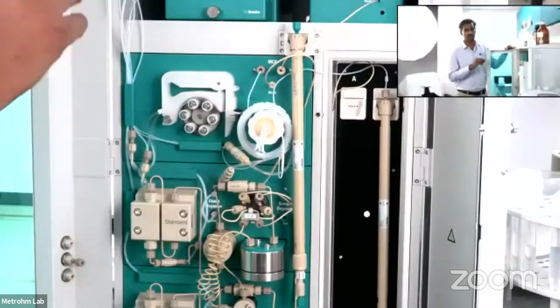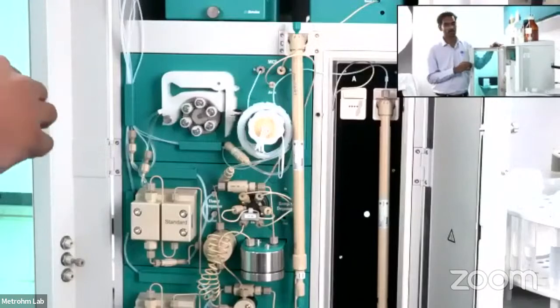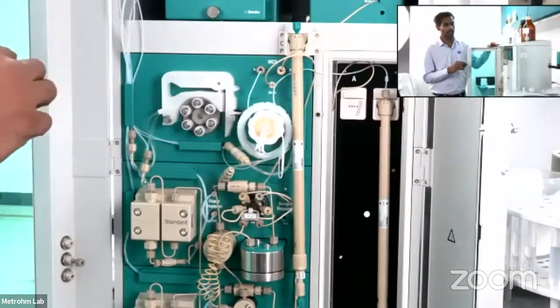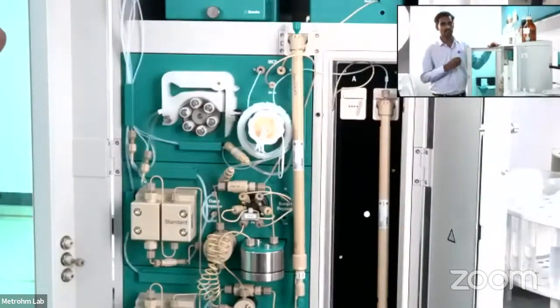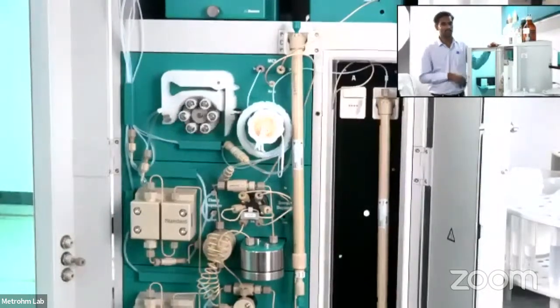Okay, so how many injections were done and how many hours this column has been operated, this kind of information will be stored in the chip. And whenever we want the data, we can recollect it in our software, where it will be visible.